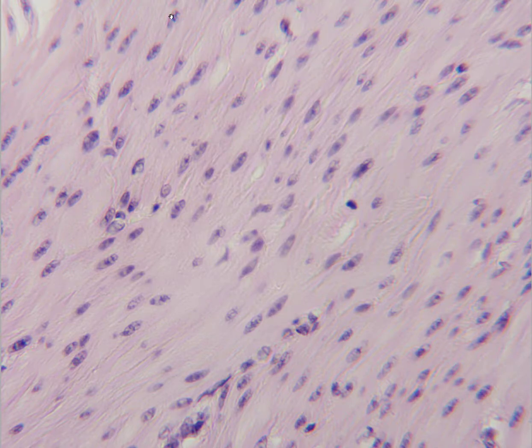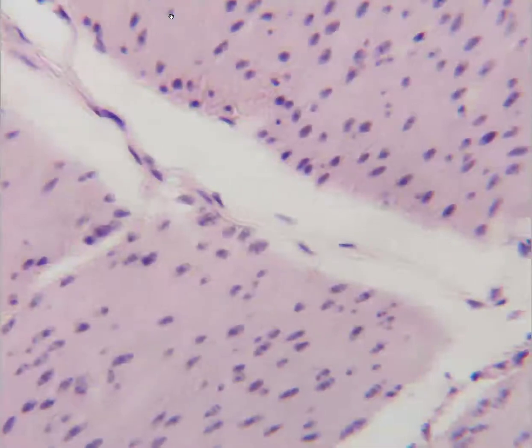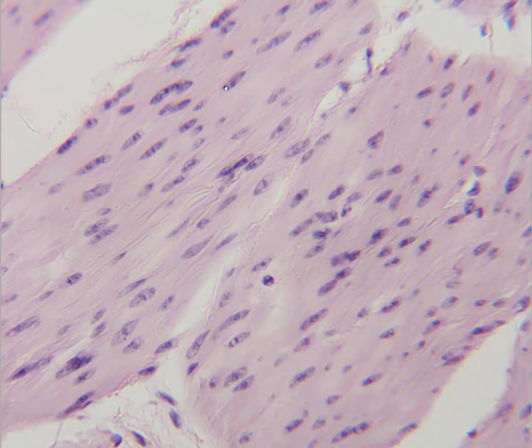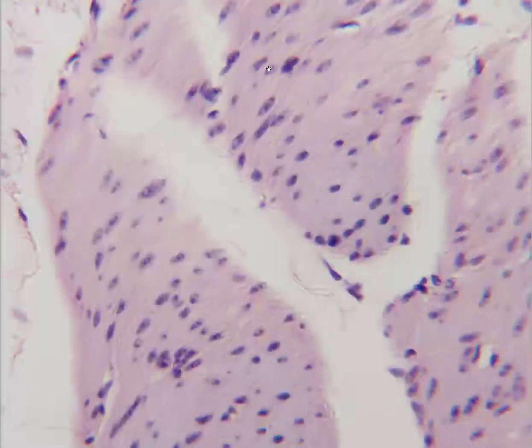We could probably take a little tour around here, look at some other instances of it so we can see smooth muscle. I might be able to find some. Here's a really good example in longitudinal section here. You can see very nicely the nuclei. You can see the length of the cells. And perhaps I could find one where they're coming more out of the plane towards you.